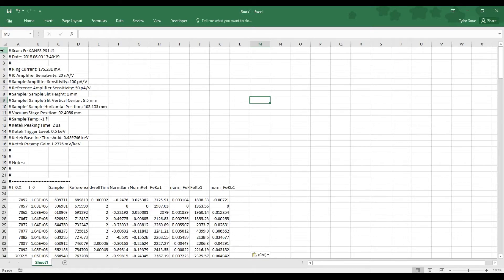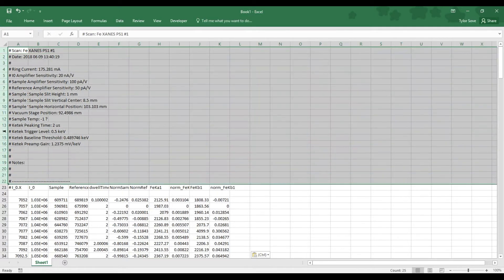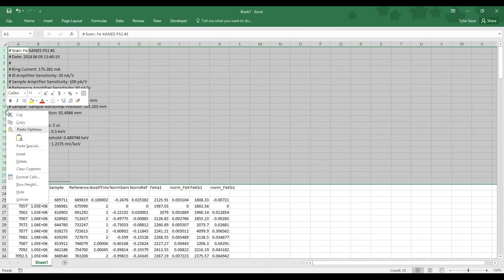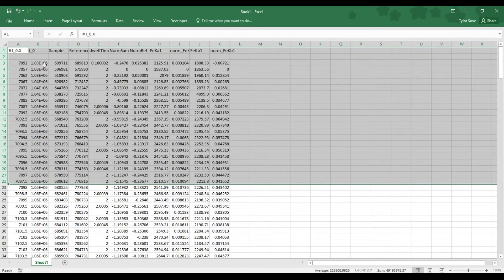So if we select Row Header 1, hold Shift as you select Row Header 22, right-click any of the highlighted row headers and select Delete, you will remove them.